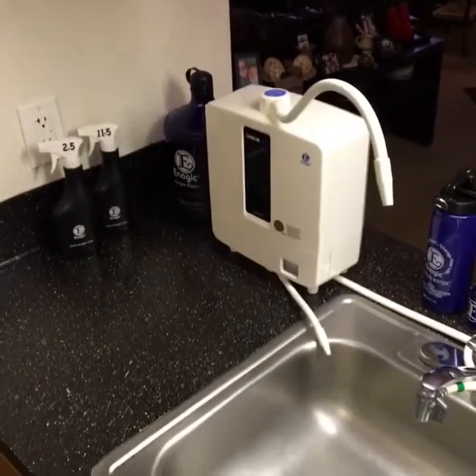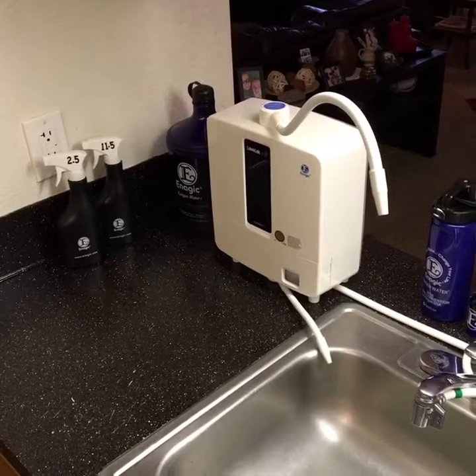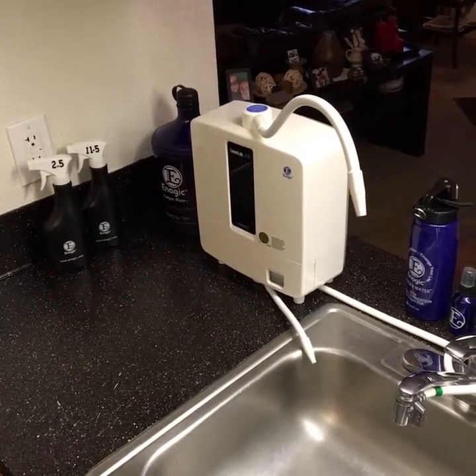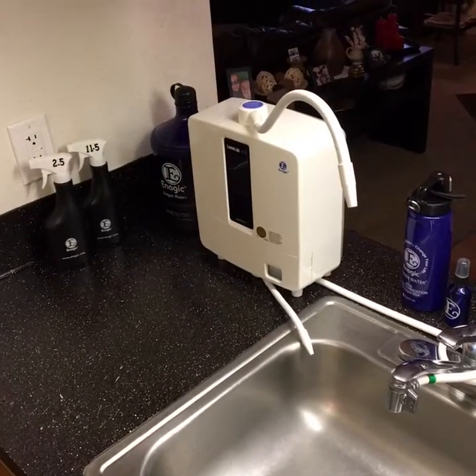Hey guys, this is Kevin and Sarah Shabbat. We're live and the purpose of this live video is to show you how to properly calibrate the Milwaukee MW500 ORP meter.